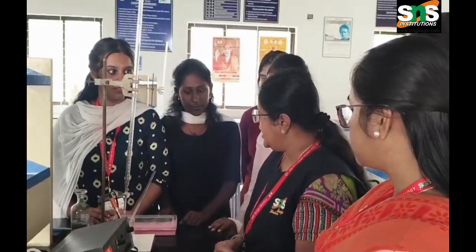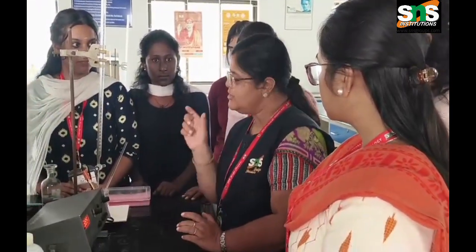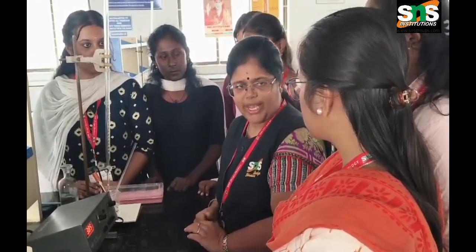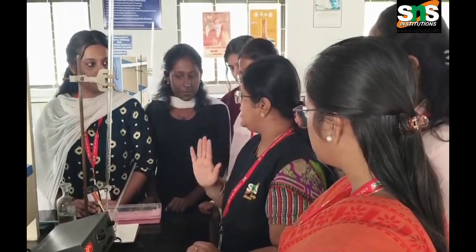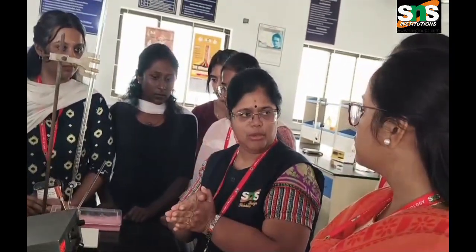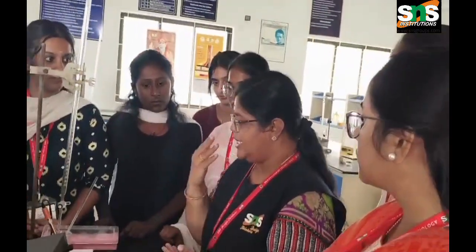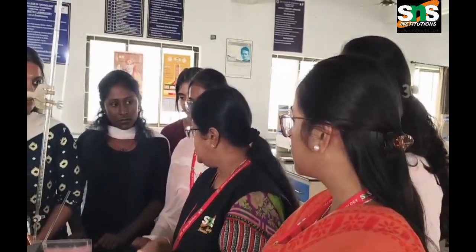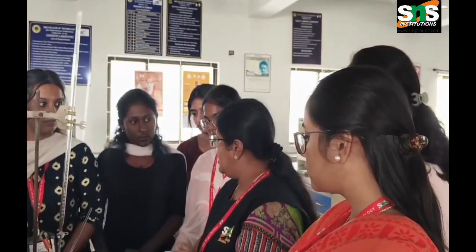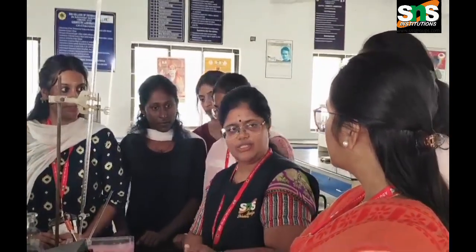So this is the conductometric titration of a mixture of acids. You have to plot a graph with the volume of sodium hydroxide along the x-axis and the conductance value along the y-axis. You will first get a decreasing value, then a slight increase, then a sudden increase. Join the points that fall in a line and intersect them to find the volume at the neutralization point for the strong acid and the weak acid. From there, do the calculation using the volumetric method, V1 N1 equals V2 N2. Okay students? Thank you students.